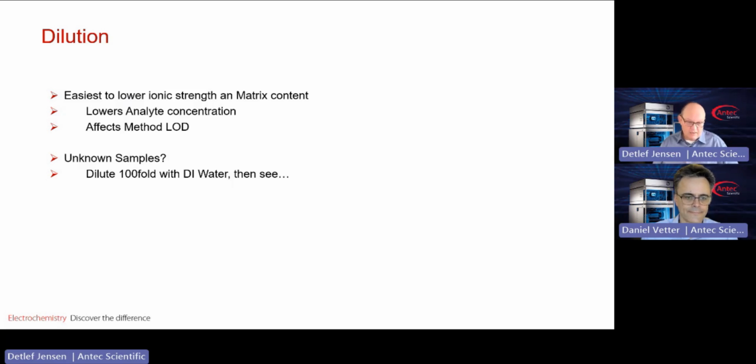Now, in carbohydrate analysis, in HPAEC-PAD, pulse amperometric detection, we have plenty of sensitivity. We have a highly sensitive detection scheme that allows us to not only dilute the sample significantly, but also use smaller injection volumes to address situations in which we have an impact of ionic strength on the retention times.